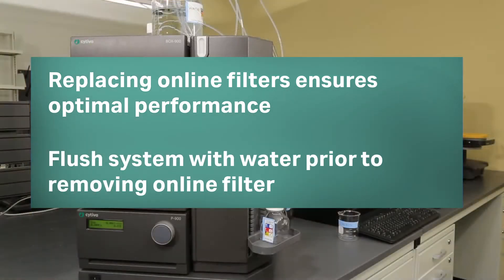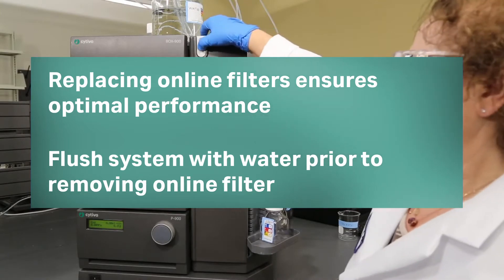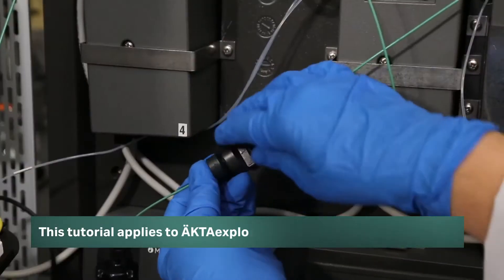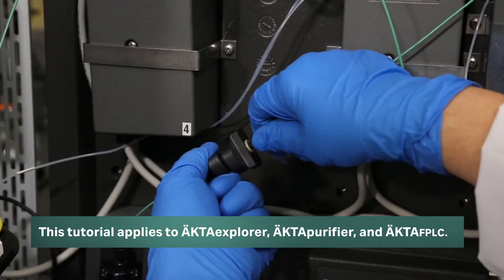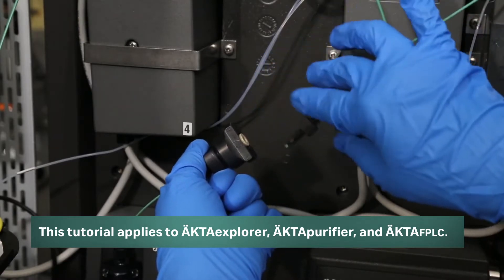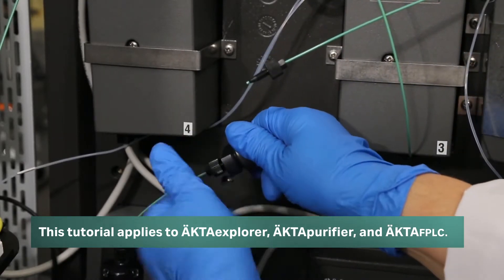Thoroughly flush the system with water prior to removing the online filter. Locate the filter housing between the mixer and injection valve. Remove the filter housing by disconnecting the tubing from each end.